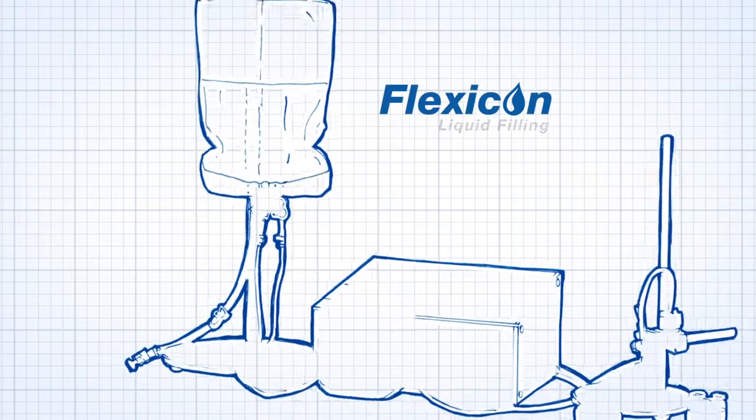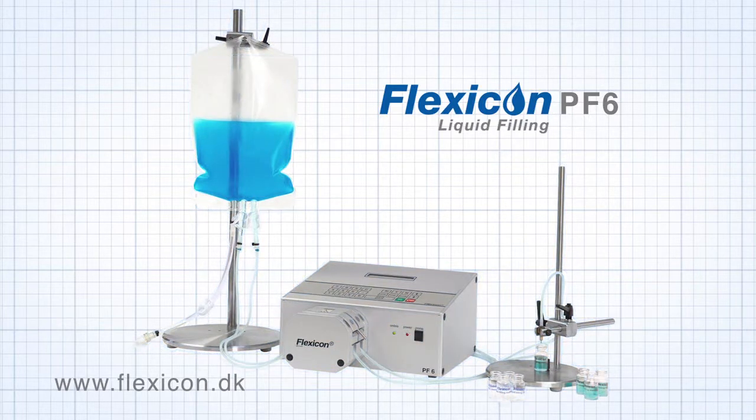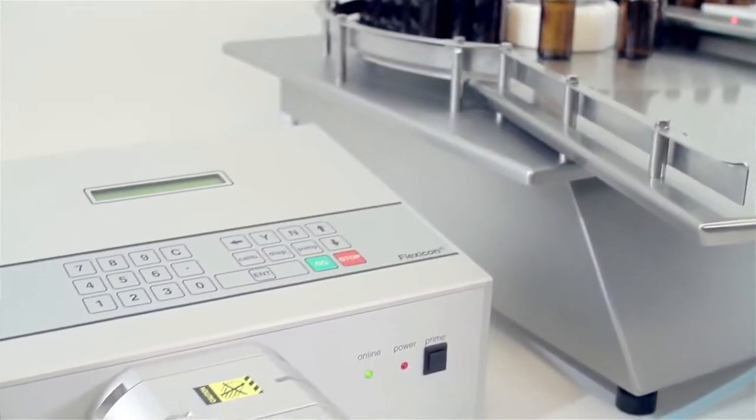The PF6 is an extremely flexible tabletop peristaltic filling machine, the preferred choice of the biopharm and diagnostic industries.